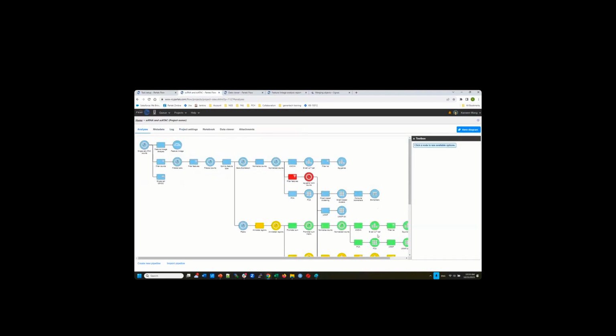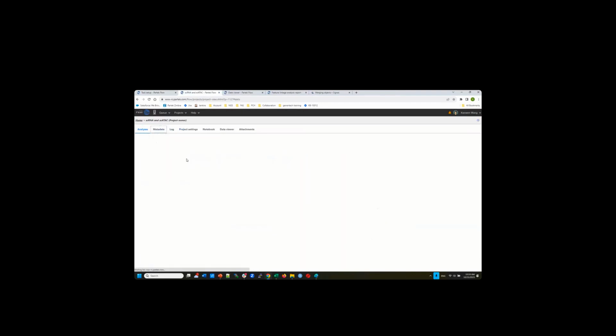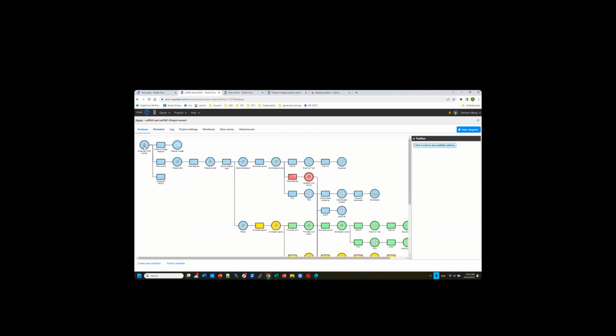So pretend you don't see anything. Right now, I only have this one sample. Okay, one sample with almost 3,000 cells in it. And you can see the number of features is very big. It really depends on your read depth, how many peaks you detect.